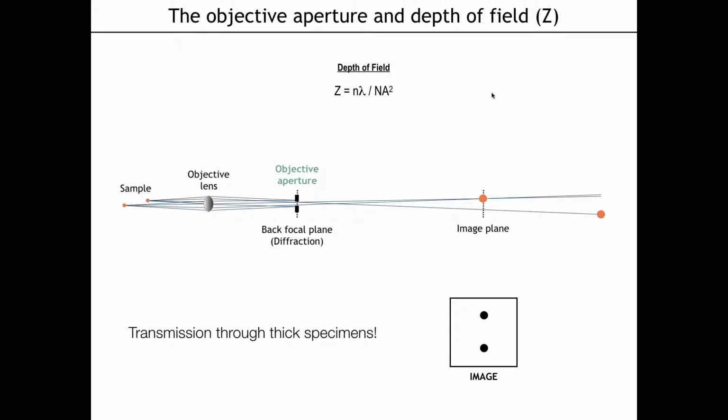This allows you to image through thick specimens. In practice, we can see through specimens that are a couple of microns thick using electrons.